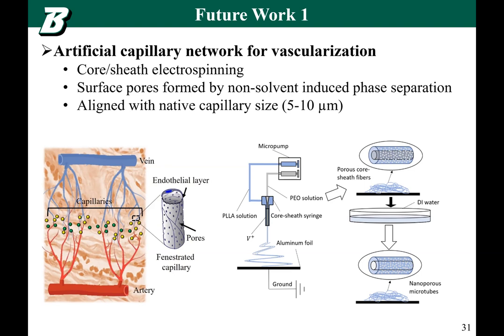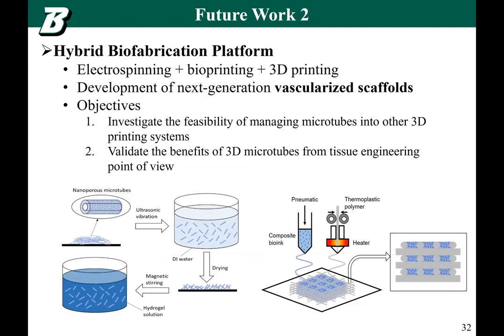So this is an ongoing project. Several preliminary studies and pilot studies have been done, but we still need to further optimize the process and culture cells to see if it is really beneficial to cell culture. And the next future work will be a hybrid biofabrication platform.